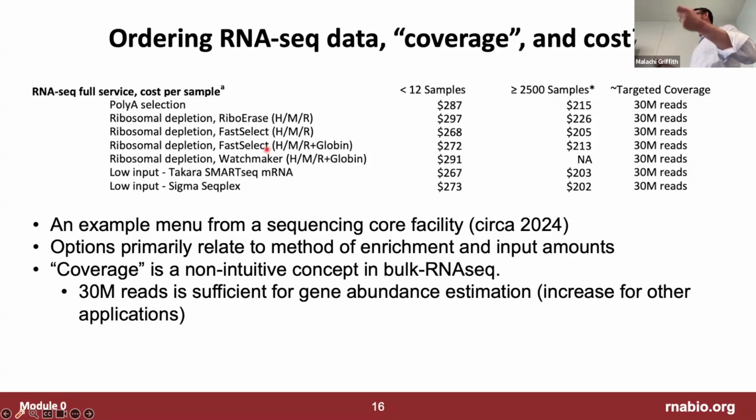And because it's a solution, and the solution is totally homogenized and mixed, you get a good unbiased sampling of all the molecules in there. And so you don't need to do replicate library generations. The library generation event is generally considered to be quite robust at this stage. It's all being done with kits and it's not that complicated.